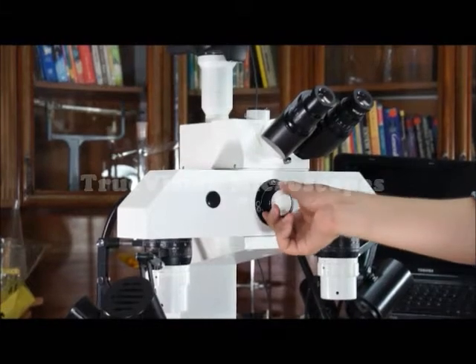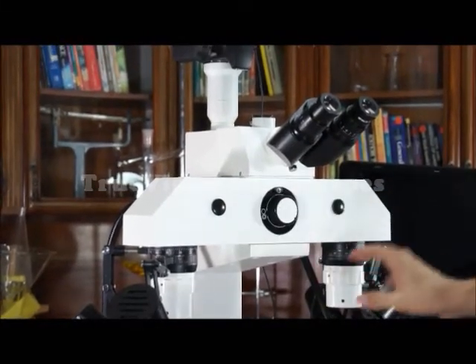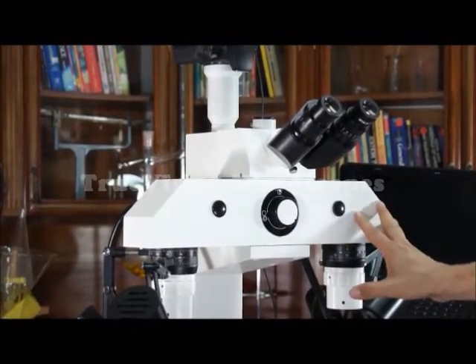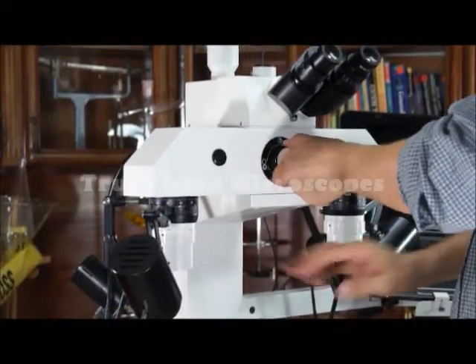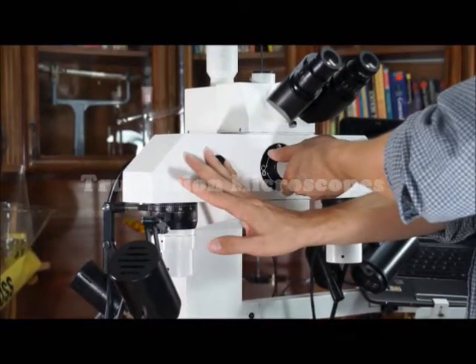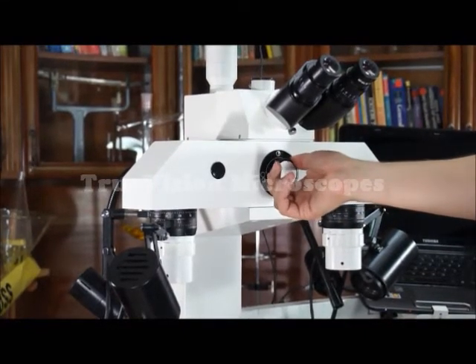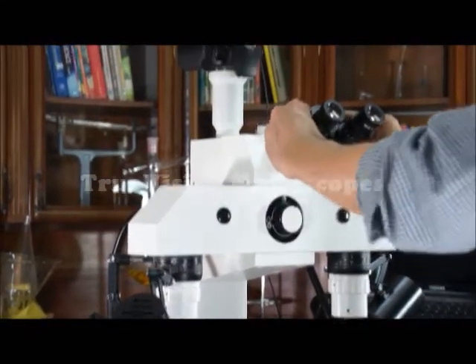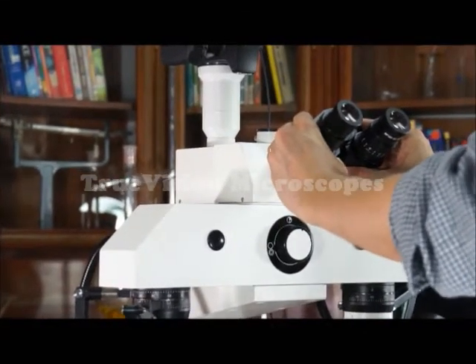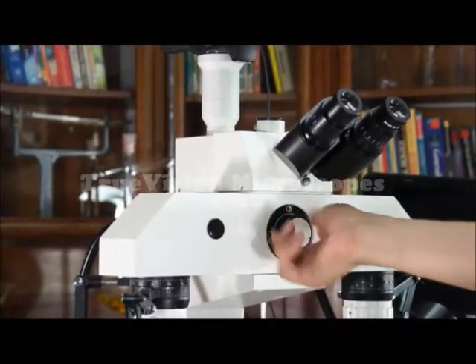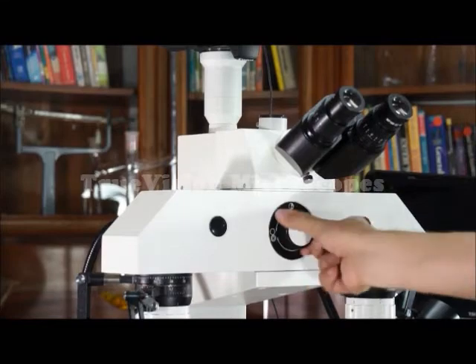This is the selector knob where you can select the image from the right side, or you can select the image from the left side, or you can select to have portions of both images in your field of view. You just turn the knob to get the image that you need.